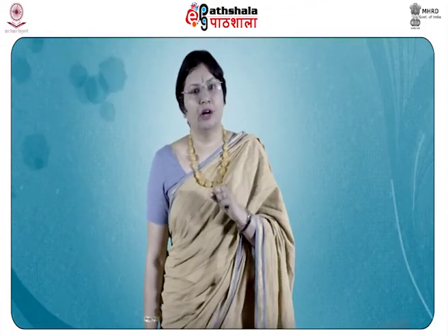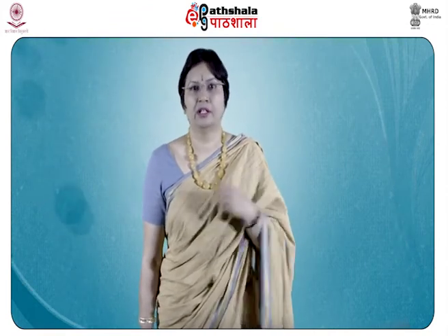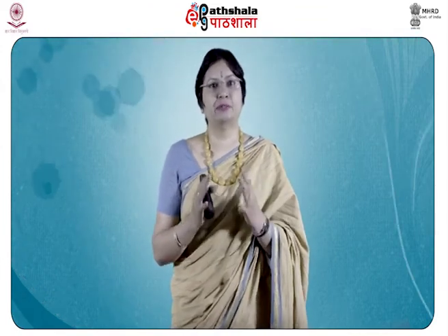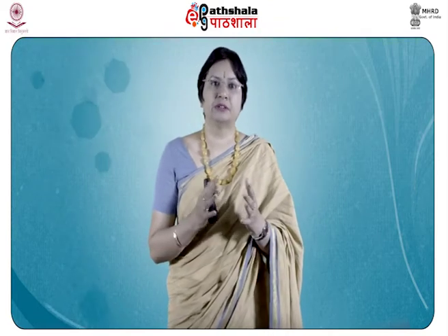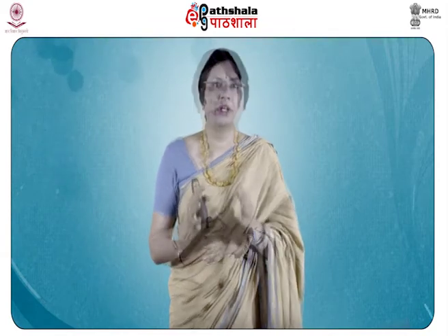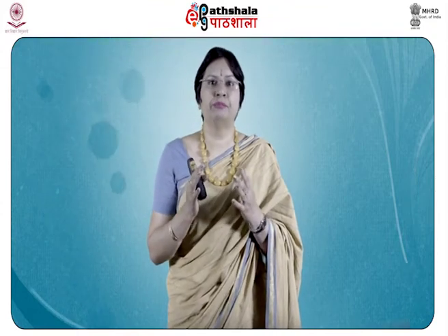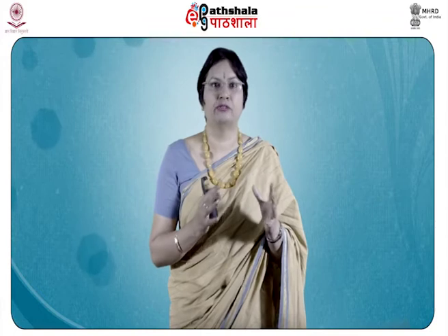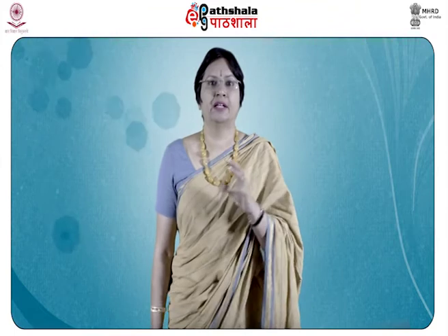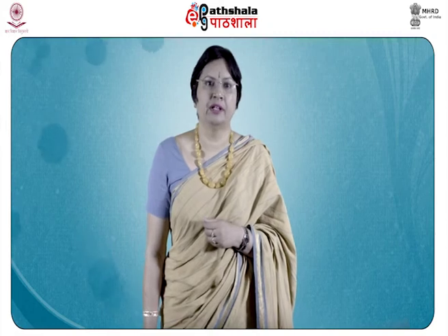And we will also see how the flame test for sodium, potassium, barium, calcium and strontium can be done. In addition, we will do some chemical tests for inorganic anions making their pyridine extract, and there comes the sulfur, and then we will also see how the TLC of cations can be done. We will also see how the chemical test for some anions in pyridine extract can be done, like for sulfur, and how the thin layer chromatography of some cations like aluminium, zinc, arsenic, barium, mercury and lead can be done.